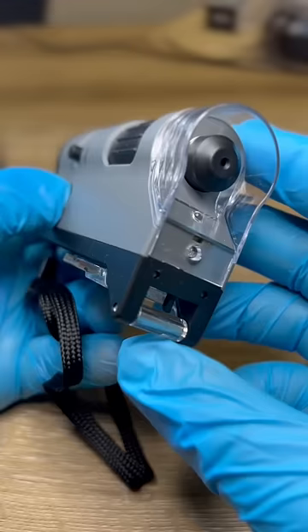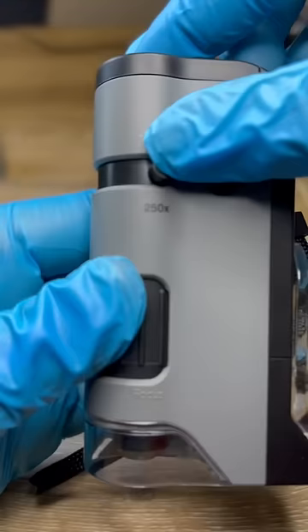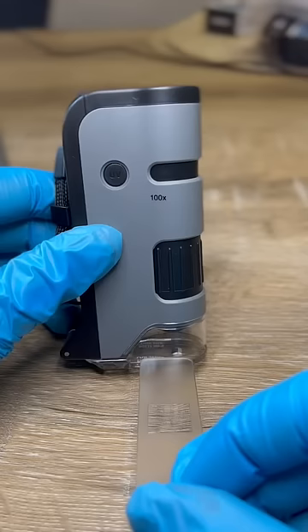It has both regular light and UV light. It has 100x to 250x zoom, which is the optimal viewing range for a water bear. It has easy focus. And my favourite feature — this tiny bench that flips around and lets you put a microscope slide in it.